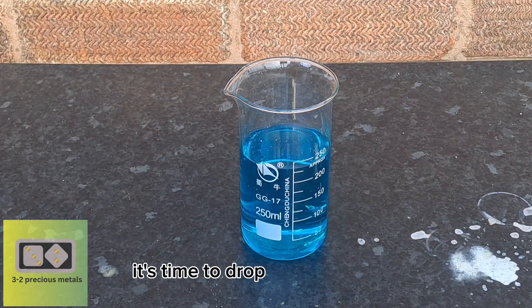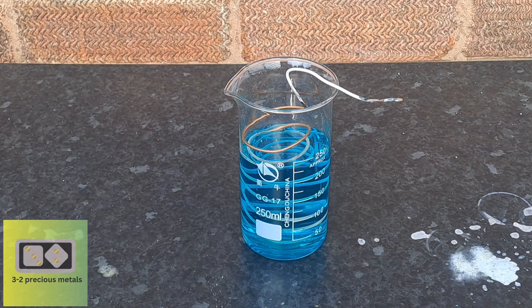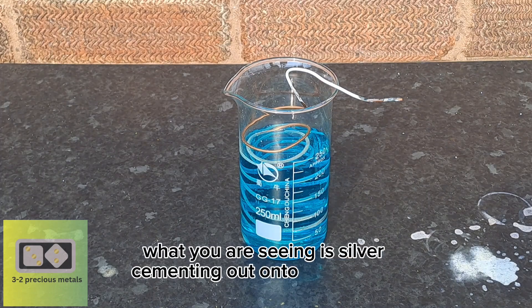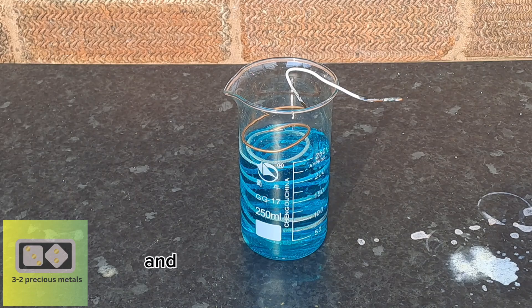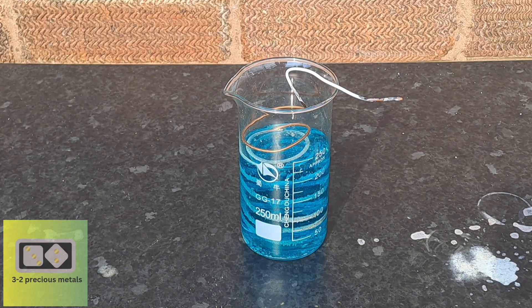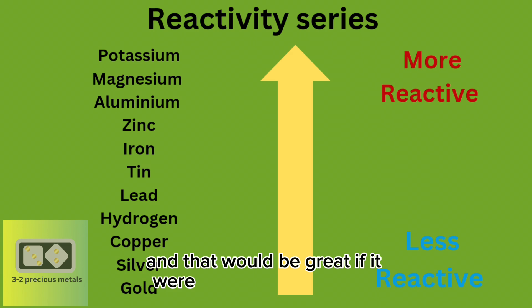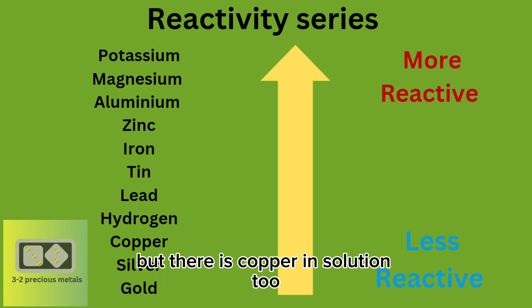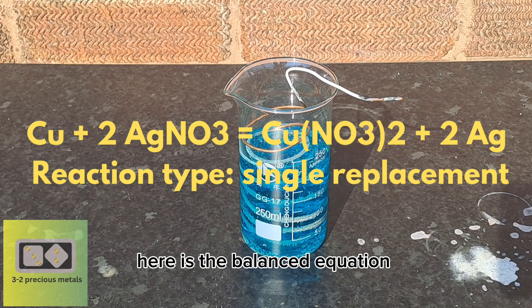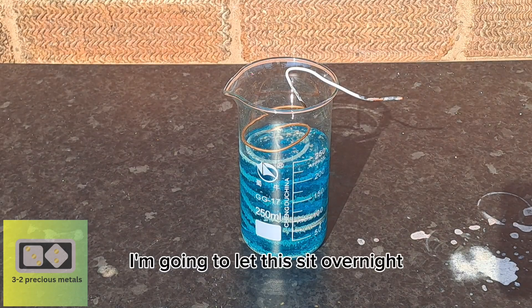With the solution filtered, it's time to drop out some silver. I have put in a piece of copper coil to displace the silver and knock it out of solution as a silver powder. This reaction happens immediately — what you are seeing is silver cementing out onto the copper coil, shown here in real time. The copper is going into the solution and the silver is falling out. This happens due to the reactivity series of metals — anything above silver trades places with it. Here is the balanced equation for the reaction. I'm going to let this sit overnight and clean it up in the morning.